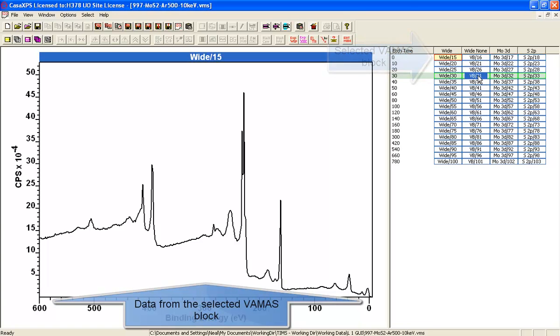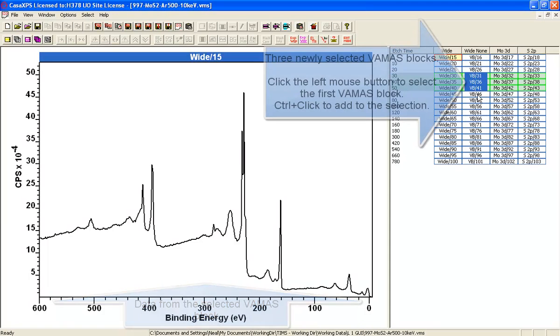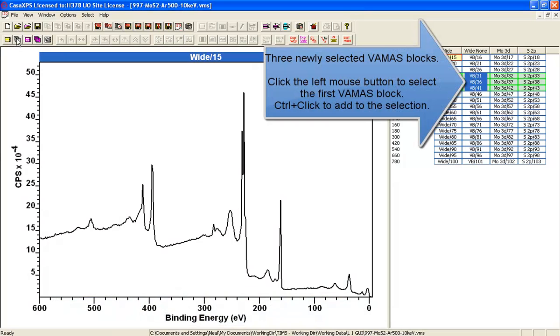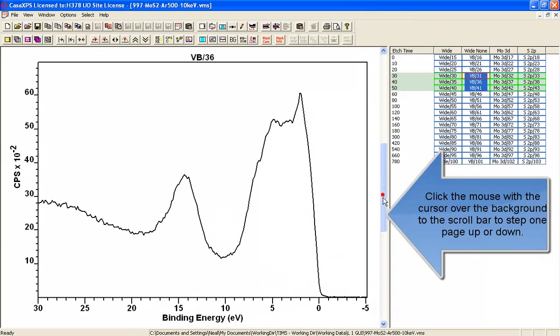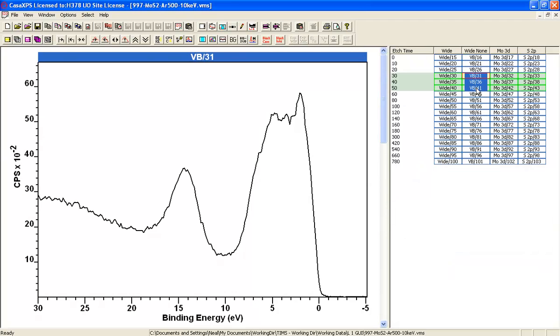If I select a set of spectra and press the display F1 button, I get a scroll list corresponding to the spectra that have been selected on the right side, which now appear on the left side.